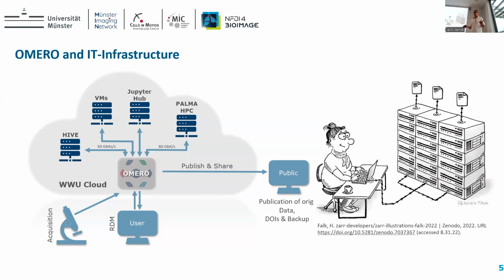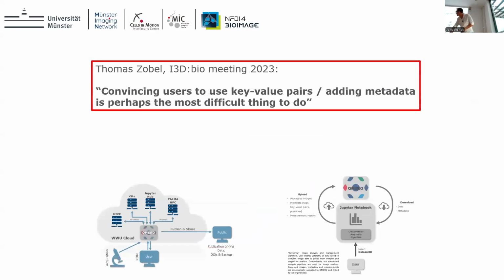Yes, and we thought, okay, then we can make an in-place import or kind of an automatic import to Omero. So we do not have to duplicate the data from the cloud to our Omero data tier, as we do if we are using the inside client. So this is kind of a duplication. But we need a rule for how people save their data, and that they are not deleting the data after the in-place import. And when we discussed this, we recognized we need people also to annotate their data.